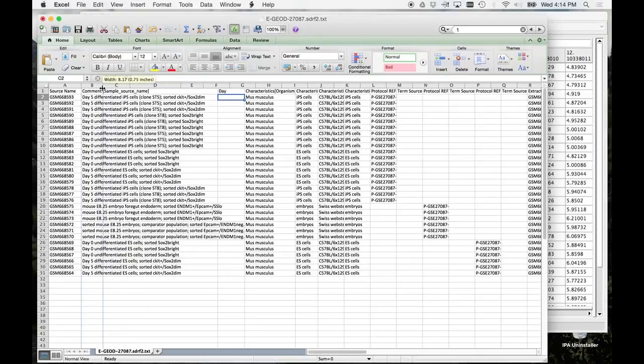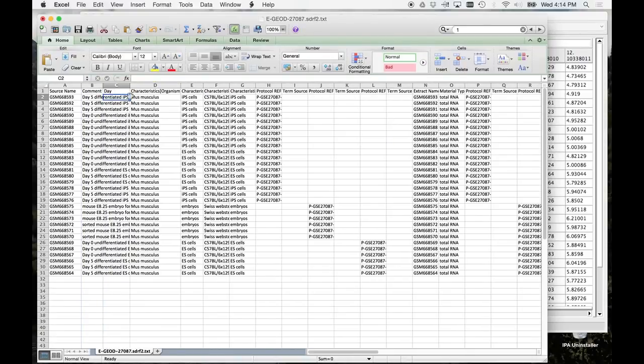This is very technical, so pay attention. I put a 5, copy that, and then paste it wherever I see the 5 over in the other column. And I know, yes, you can write programs that do this for you. By the time you wrote that program, I'd be done. And then let's do it for day 0. Same thing.